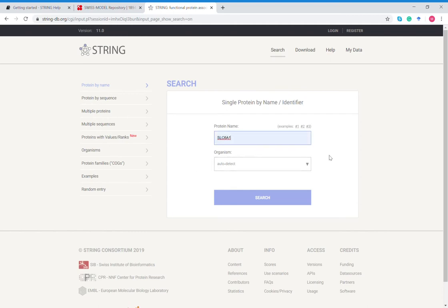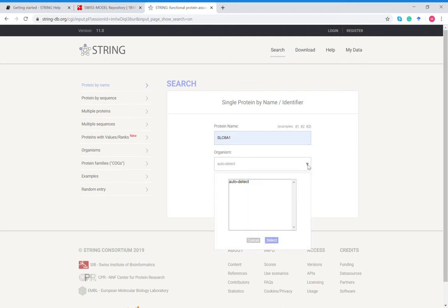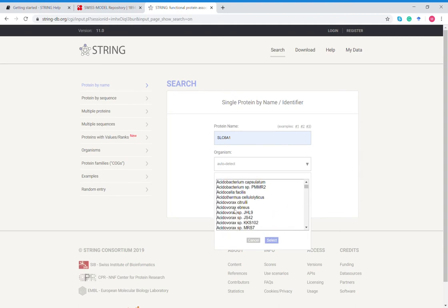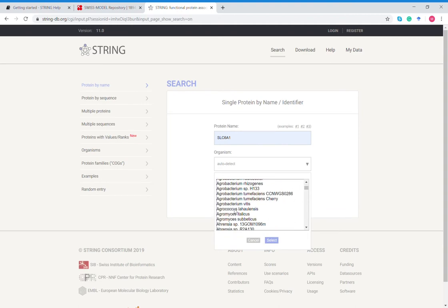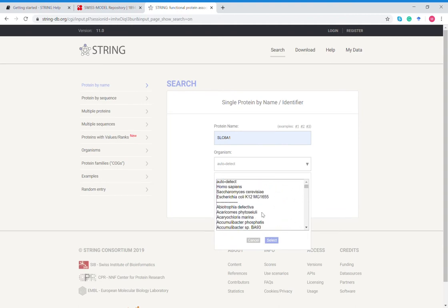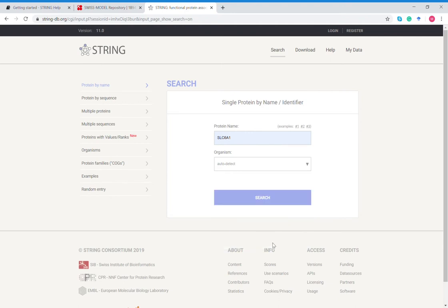You just type in the protein name and you can look at specific organisms or you could auto detect. If you click this dropdown you'll see all the organisms you can search for. This is over 2,000 organisms. I'm going to auto detect just so you can see how much information you can pull.